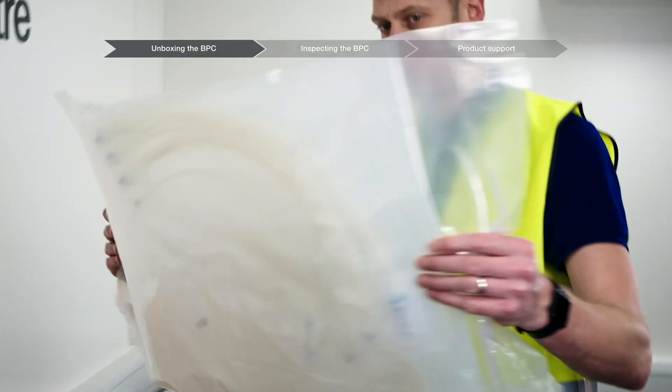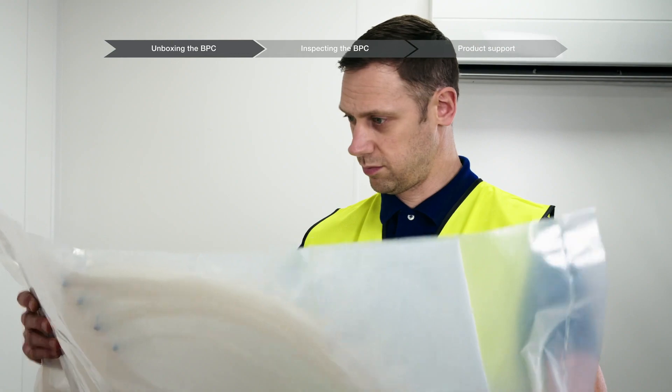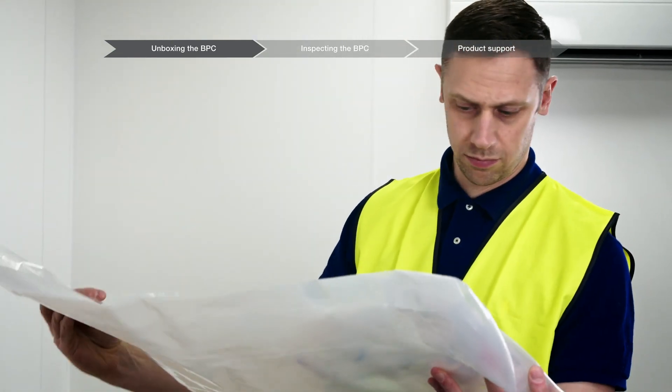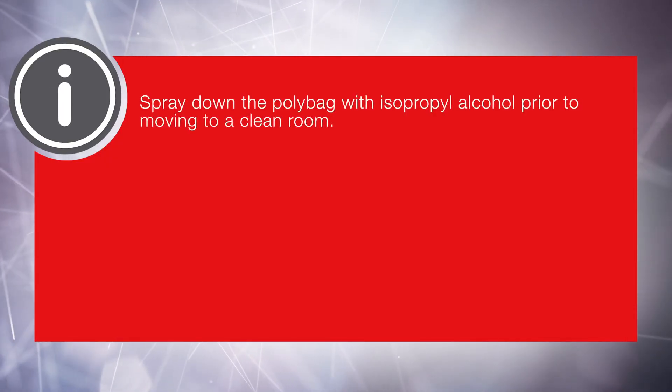After removing the BPC from the box, inspect the outer poly bag for any damage. Spray down the poly bag with isopropyl alcohol prior to moving to a clean room.